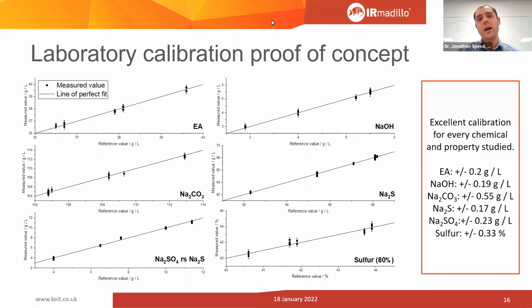We are also working with a third party to implement in situ ultrasonic descaling, where the spectrometer has a descaler that focuses on the actual end of the probe itself and periodically blasts off any scale. So that would completely get rid of that problem altogether. So there are various options out there. So yes, in principle, it is a problem, but there are ways of dealing with it so that it doesn't become a show-stopping problem.